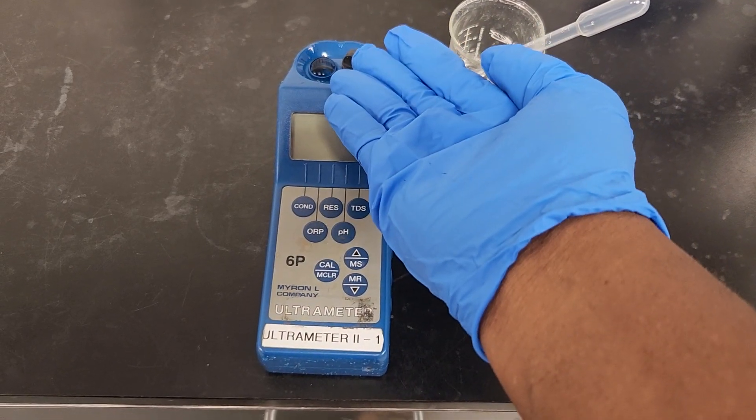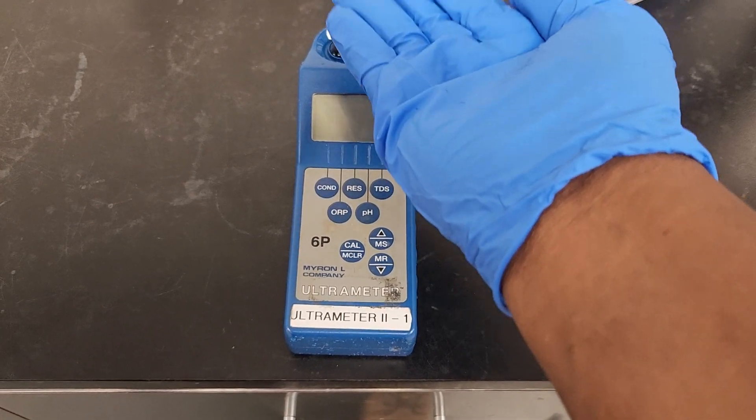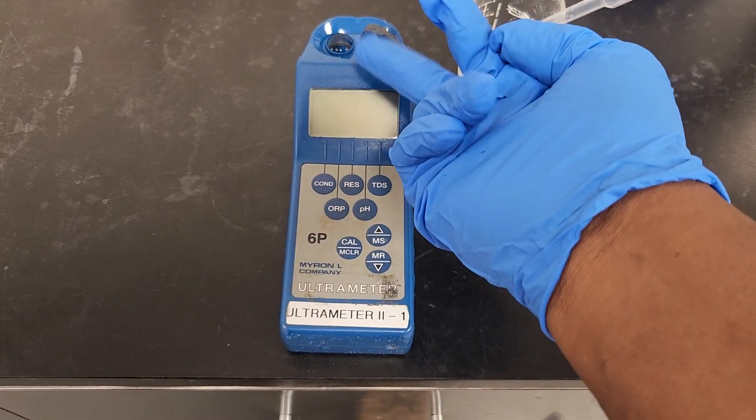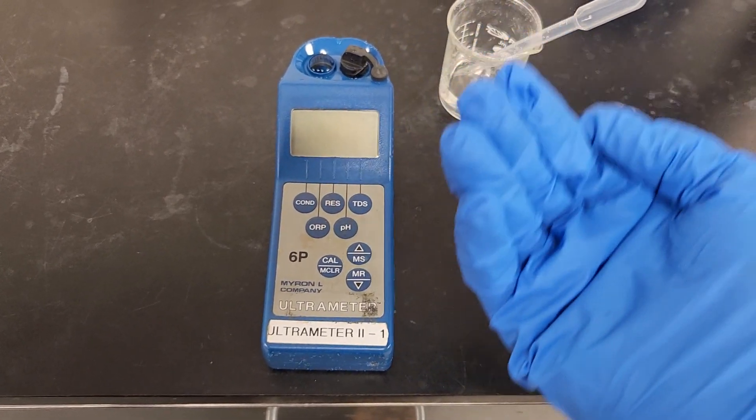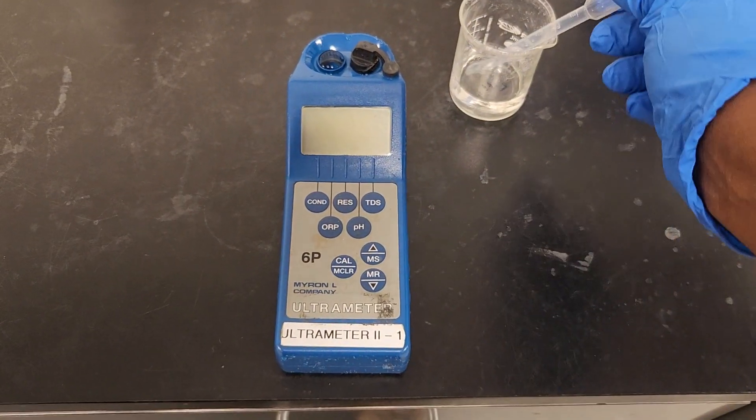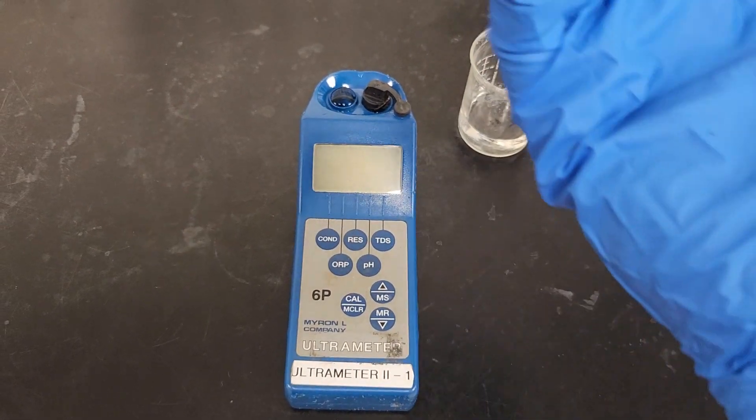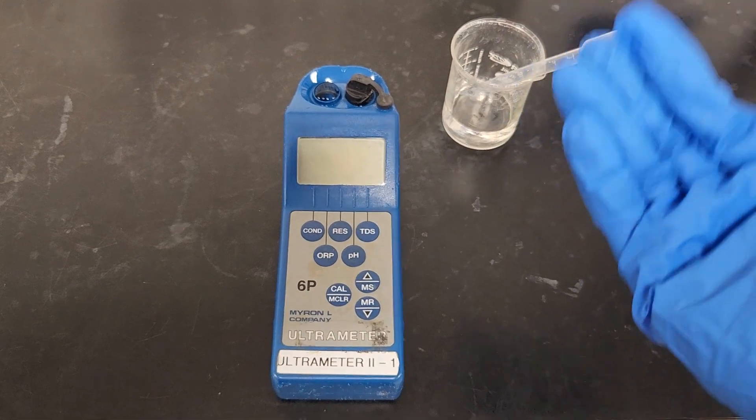So actually before this video, I mean before I started videoing, I've already done the cleaning. So what I do is collect this pipette, put it inside, fill it up, discard it, do it three to four times and it's ready to measure your conductivity and your total dissolved solid.